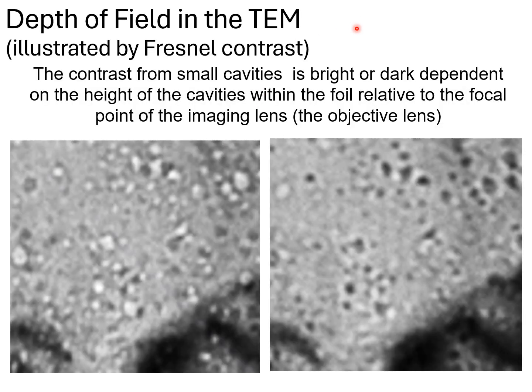So the Fresnel contrast, as I said, is something which can be applied to cavities. These are some small cavities. These cavities are only of the order of 1 to 2 nanometers in size.